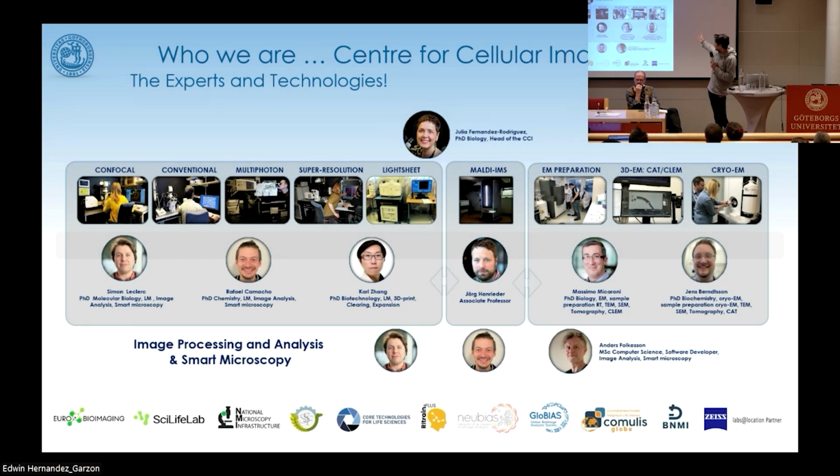And of course, a big part of our services is electron microscopy. In particular, we have a TEM and SEM. What we really love to do is volume EM and try to correlate different modalities with the EM, so a lot of processing steps are also included in there. You will see that the staff all have a very broad background, because all the questions are so broad. That's our advantage: to have expertise at many different levels so that we can support the different projects.